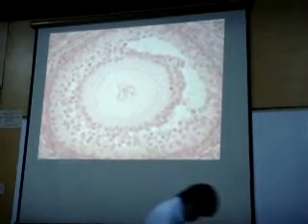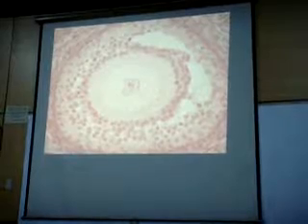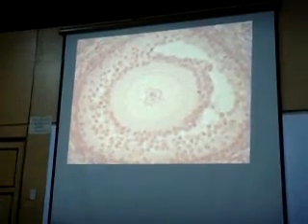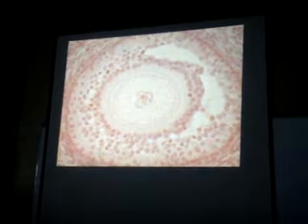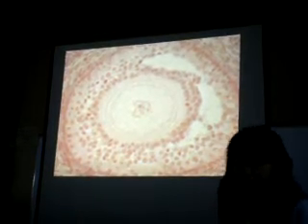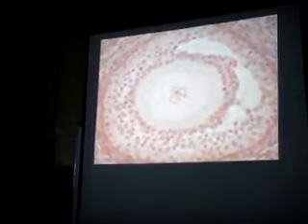Microscopy, what are you supposed to know about the ovum? Identify pointed structure, be specific. What will your answer be in the examination? Okay, nucleolus. Identify whole structure bracketed. Be specific. Identify pointed area. Cytoplasm. Okay? So, identify pointed structure.